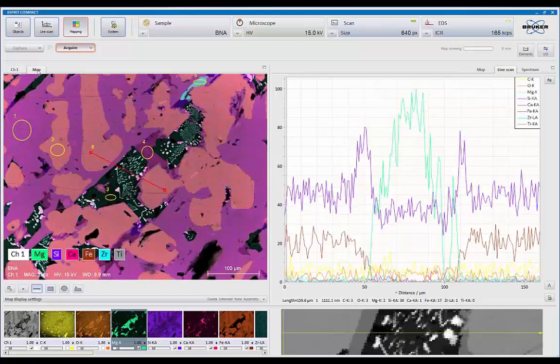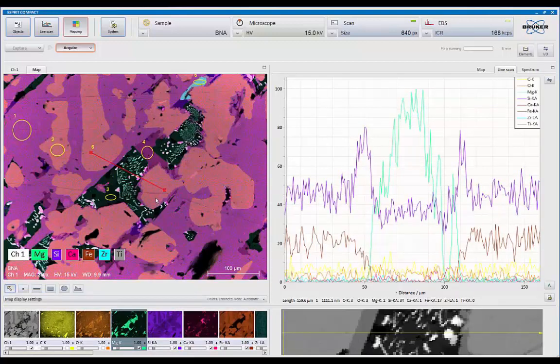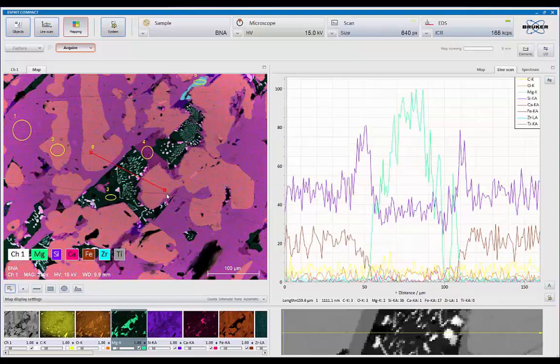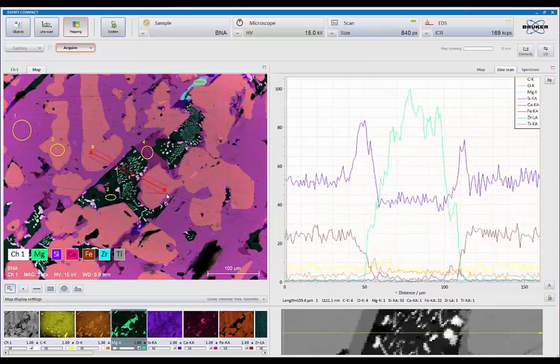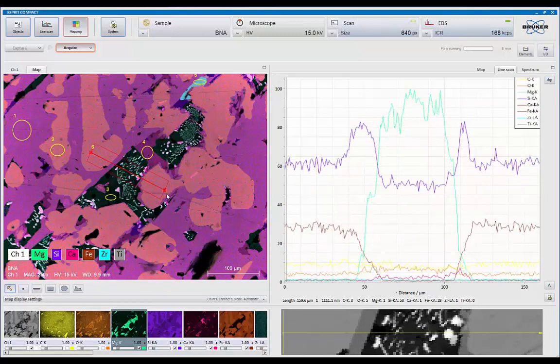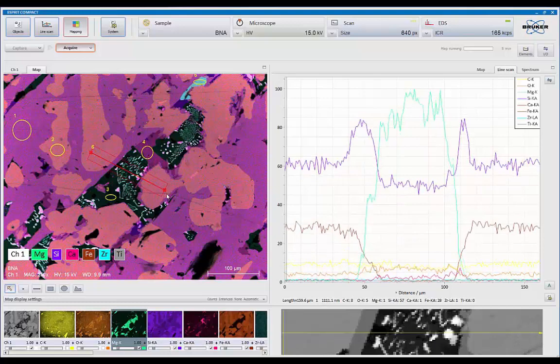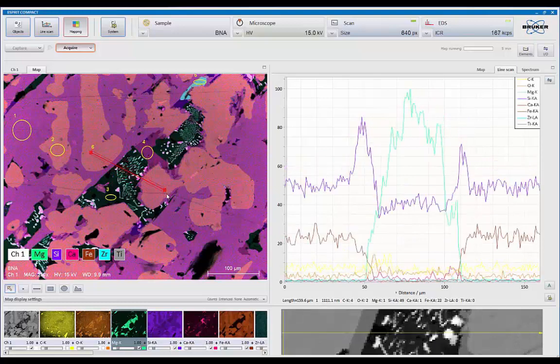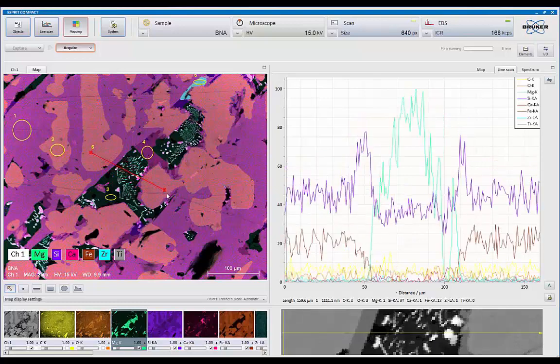There they are. And I can bring the map back over here. And now, if I want, I can click on that. And using the plus minus keys, I can integrate n number of lines on each side of that. So it will help improve the statistics.